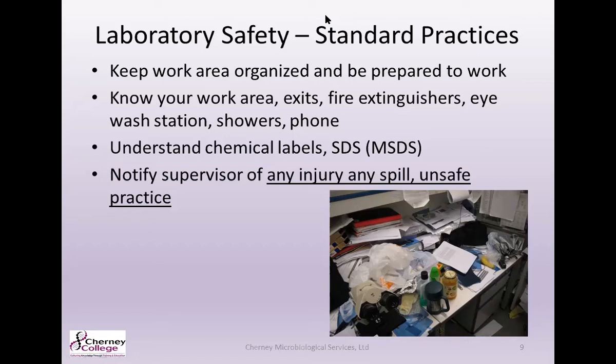So you're gonna wanna make sure that you keep everything clean and organized in its spot. Make sure that you know your work area. You're gonna wanna know where your nearest exit is, your nearest fire extinguishers. When there's a safety incident, you don't wanna panic or waste time looking for safety equipment. You should know the area that you're working in and where to reach those safety materials should you need them.